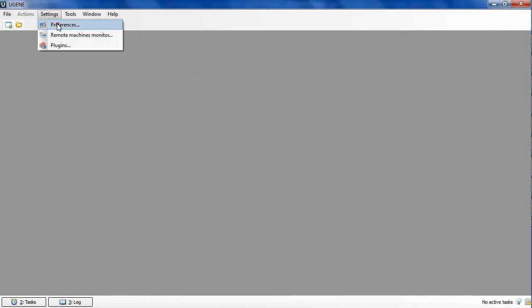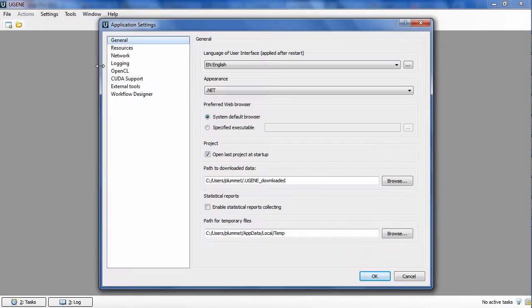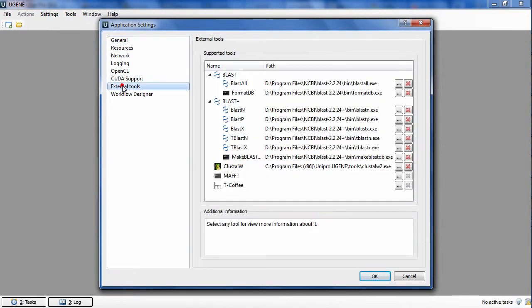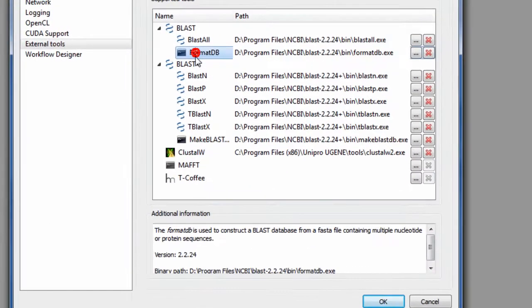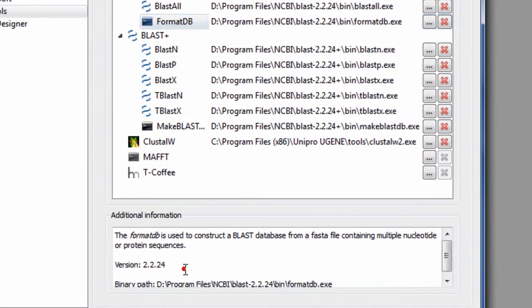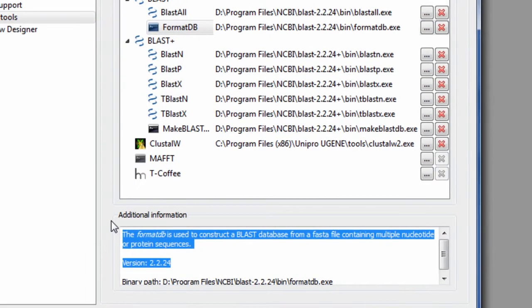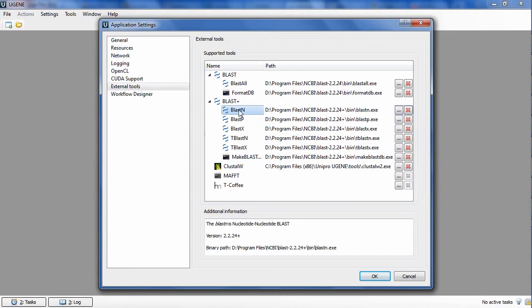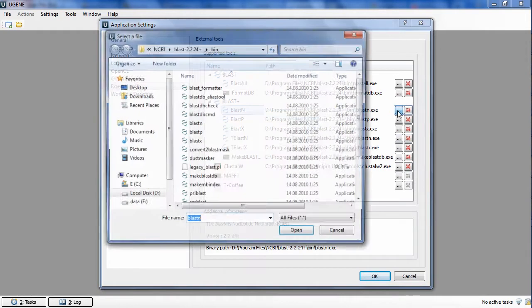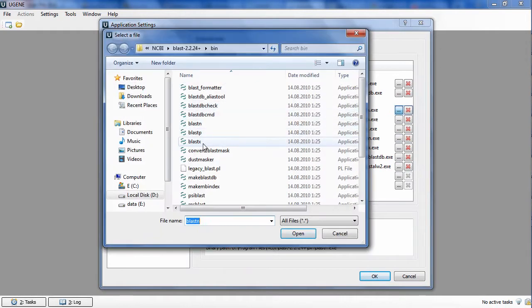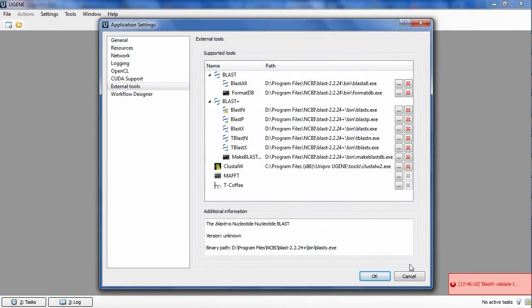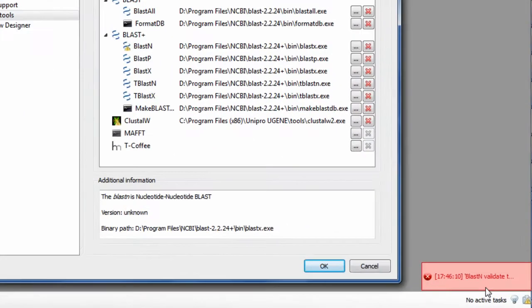The settings page itself was improved. Now there is a description for every executable file, including its actual version. And if I specify an incorrect file or version, for example BLASTN instead of BLASTP, then an error message pops up.